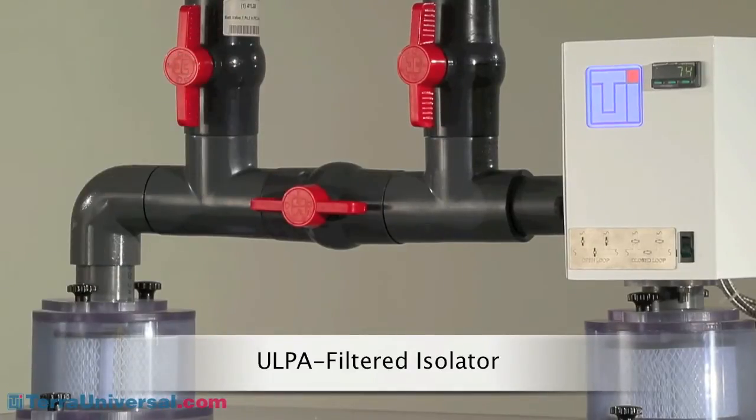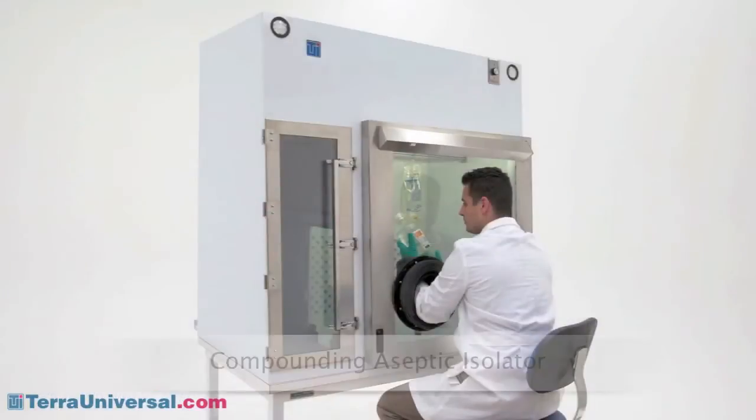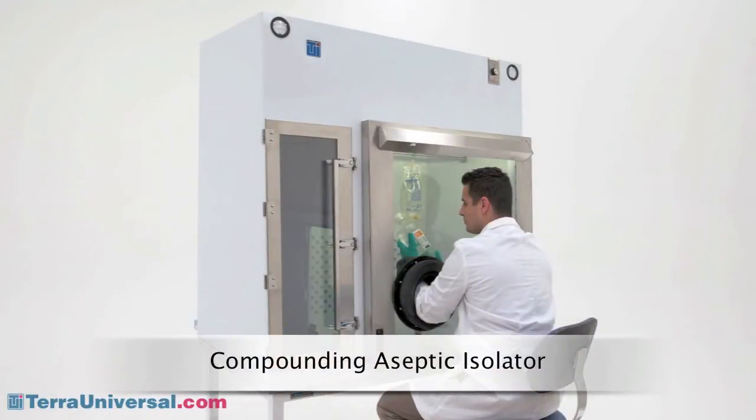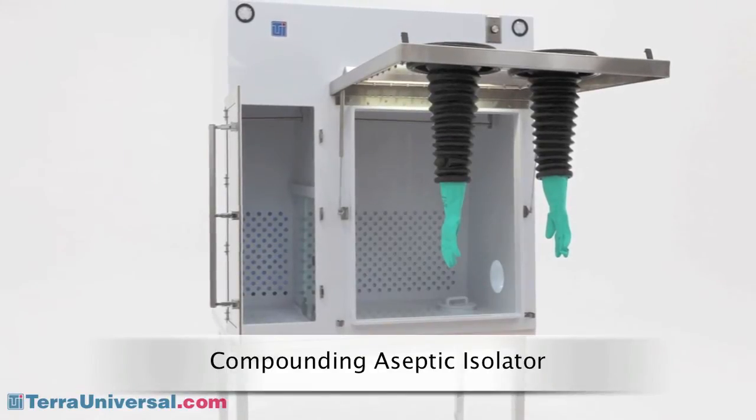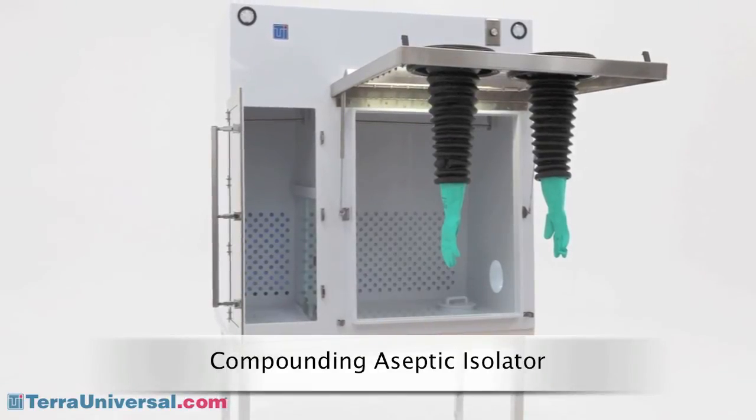An inline heater can be added for processing at temperatures up to 40 degrees Celsius. For laminar flow filtration requirements, Tera also provides a fan filter module that provides HEPA or ULPA filtration of air entering the chamber. This single-pass airflow system features an adjustable exit panel that lets you control the internal positive pressure.